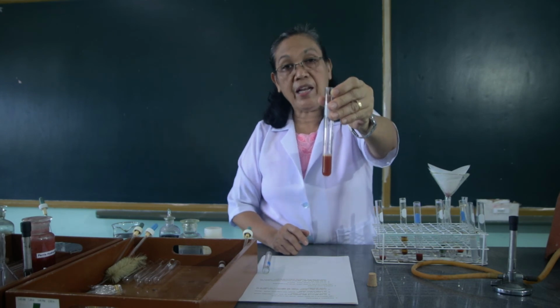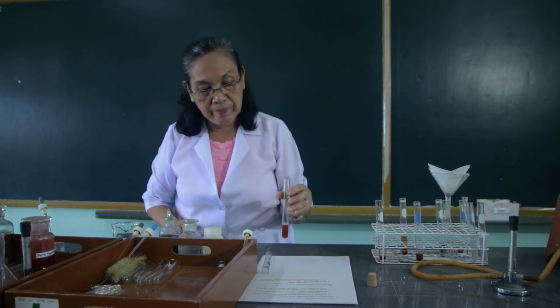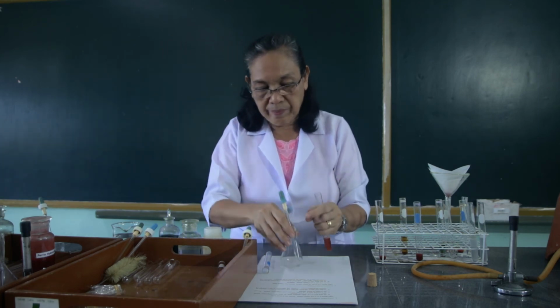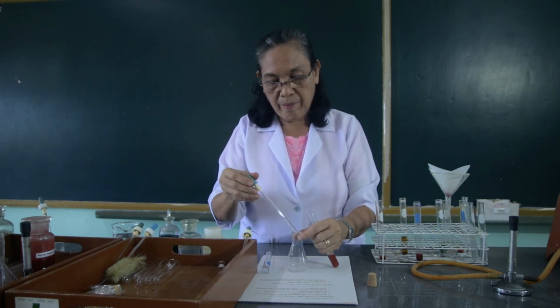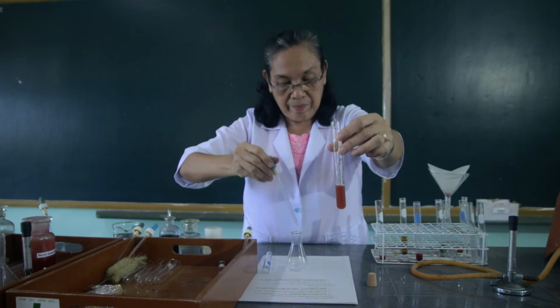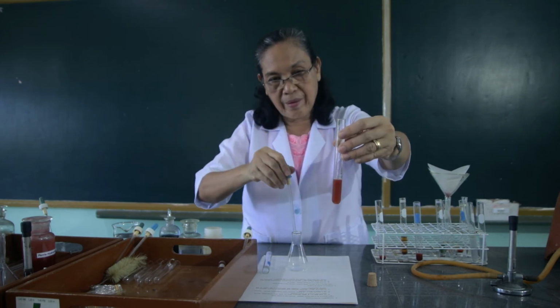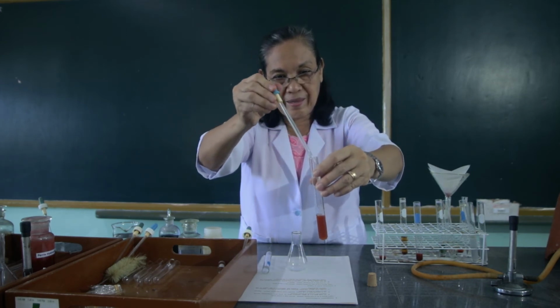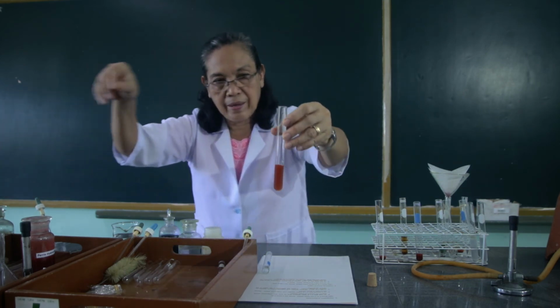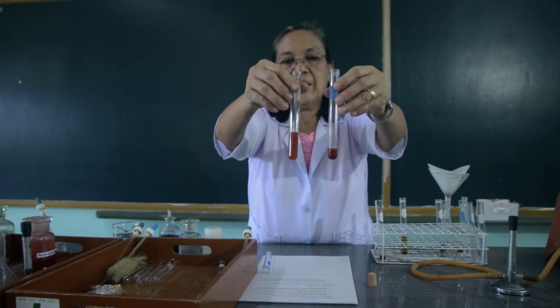Then we will add 2 ml of the arsenic sulfide. Then compare the two.